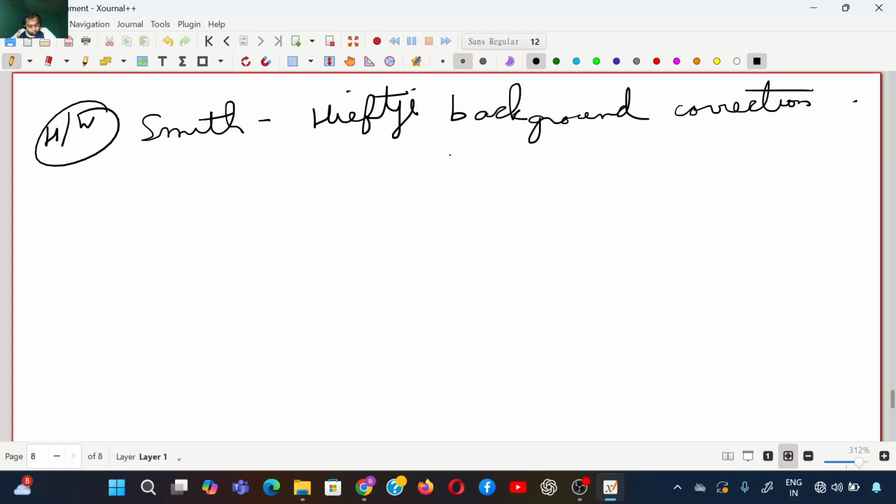Interferences, you can also classify in terms of whether it's physical interference or chemical interference, following from what we did earlier. Like we talked about viscosity, surface tension, vapor pressure, and the size of the droplets. Large droplets fail to reach the flame, reducing the signal. Those kinds of things are physical interference. But what happens in the flame, because of the flame chemistry, comes under chemical interference.